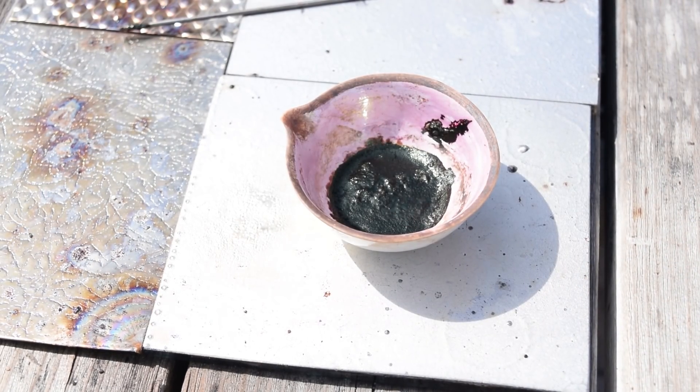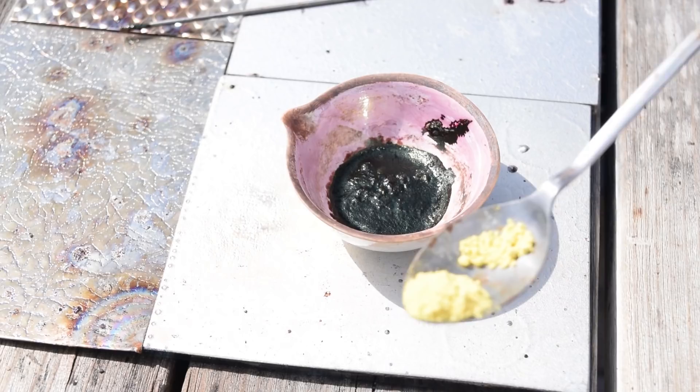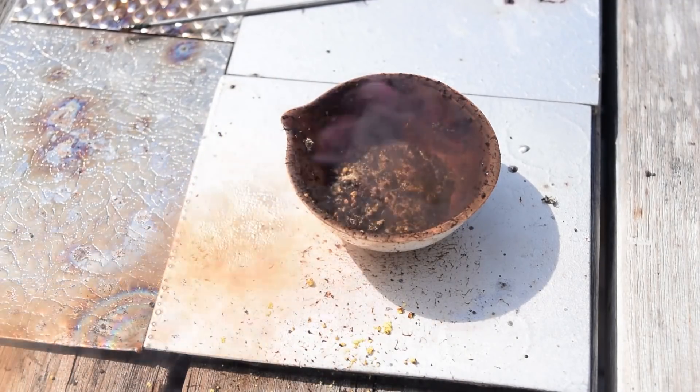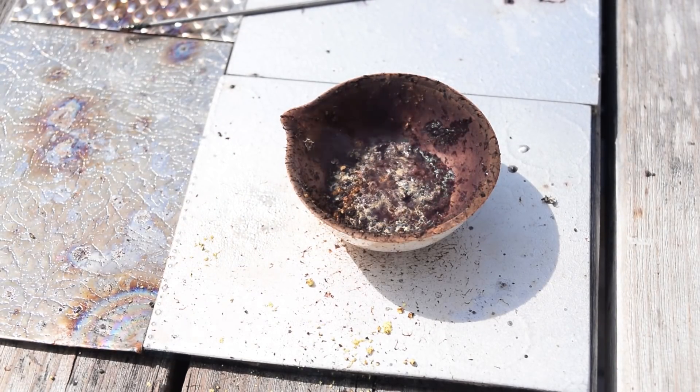Alright friends, so I really messed up — I accidentally dumped in way too much manganese. Might as well work with what I have. Next I'm going to go with some ferrous oxalate — at least what won't blow away in the wind. Go ahead and add that.